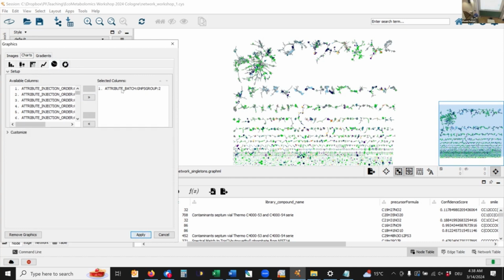And then you just need to select the different values that you actually want to display. So here there's already one selected. I don't want that, so I remove the selected one. And then by going through here, I can select the different metadata groups. And there's already one that seems meaningful to me, which is the different locations.